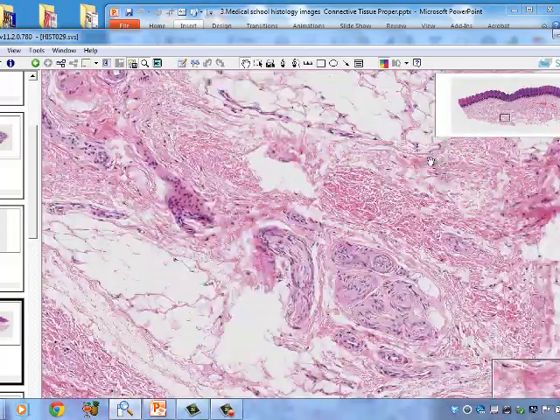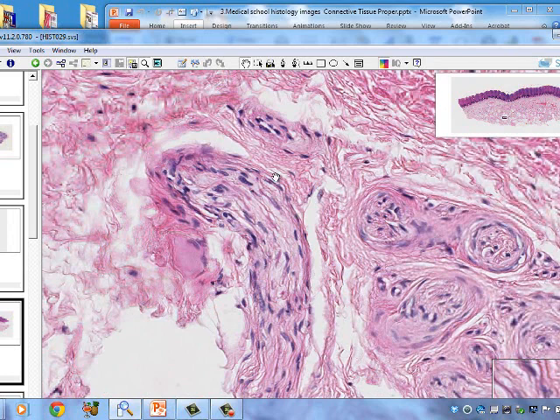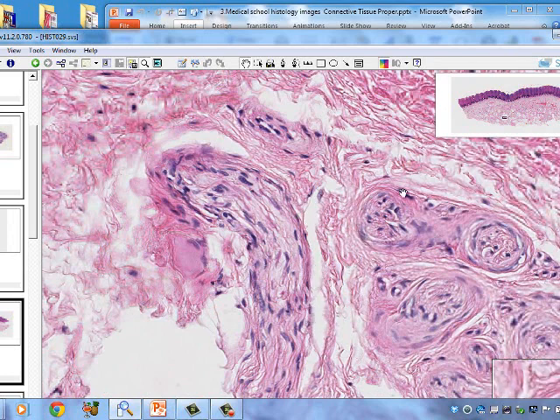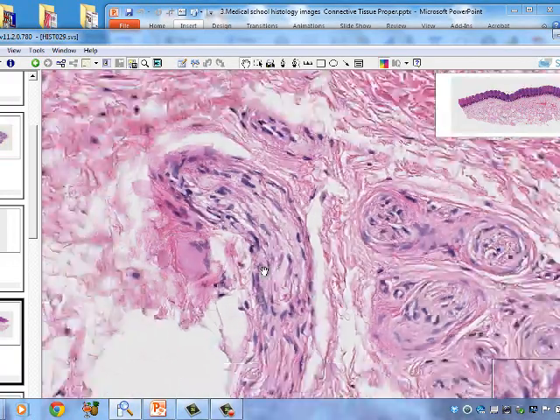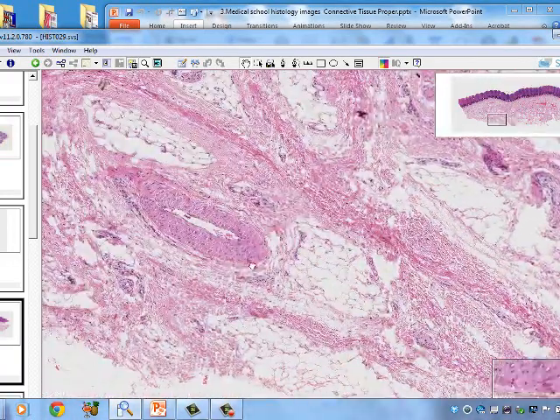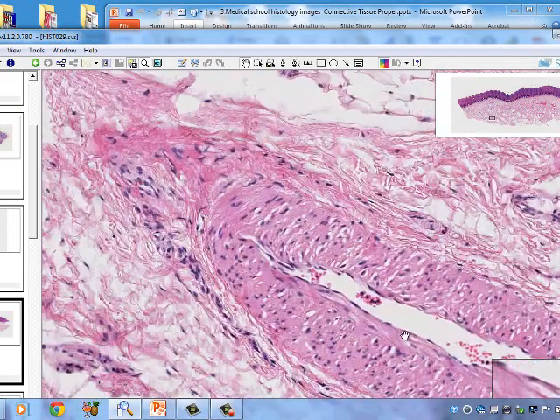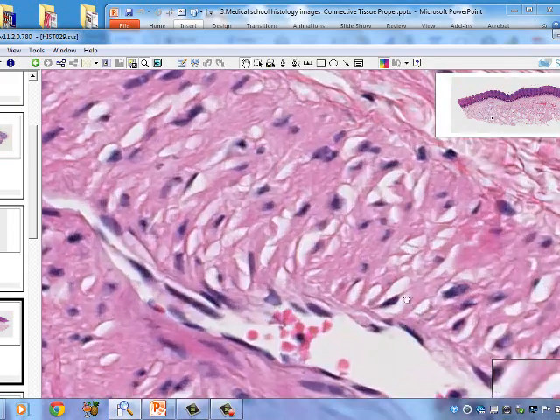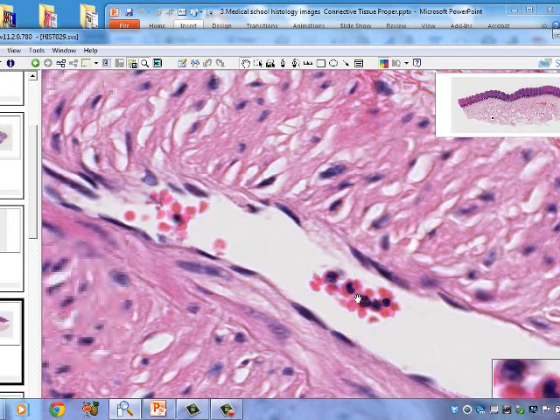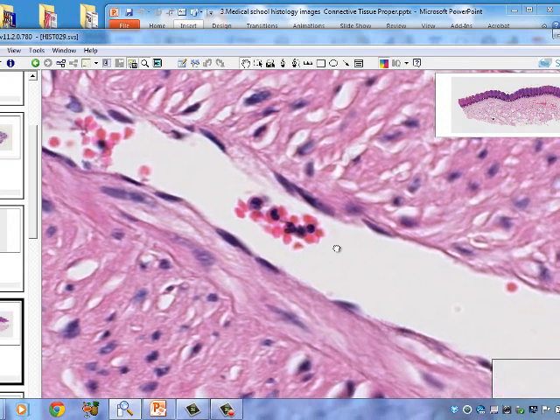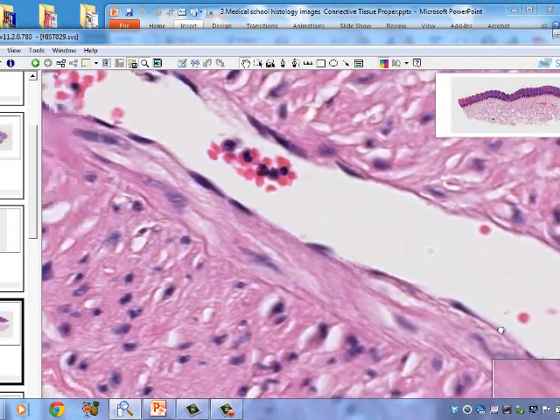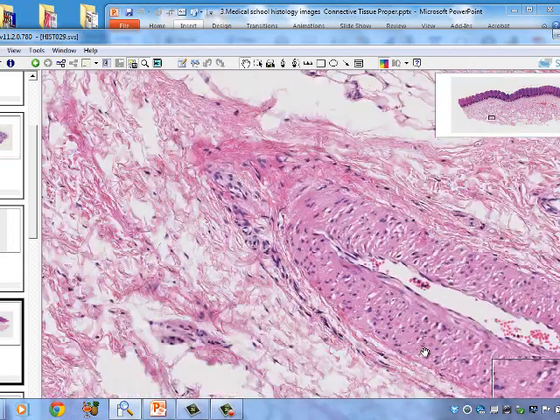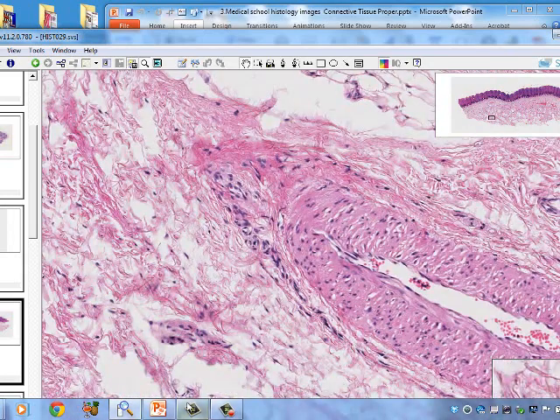More nerve is visible, surrounded by perineurium. There is also endoneurium within the nerve and epineurium on the outside of large nerves, though the epineurium is not visible here. Additional blood vessels show endothelial cells, neutrophils inside among red blood cells, and a lymphocyte visible in the blood itself.